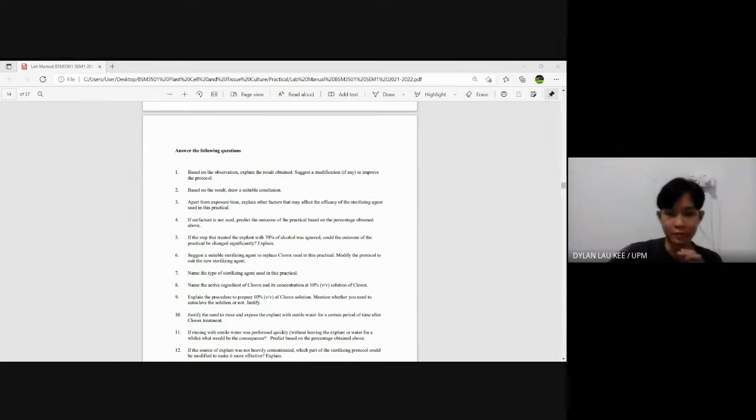Okay. Moving on. Any question? No, then we move on to question number 5. If the step that treated the explant with 70% alcohol was ignored, could the outcome of this practical be changed significantly? Explain. Okay, so I'll try for this question. I think yes.